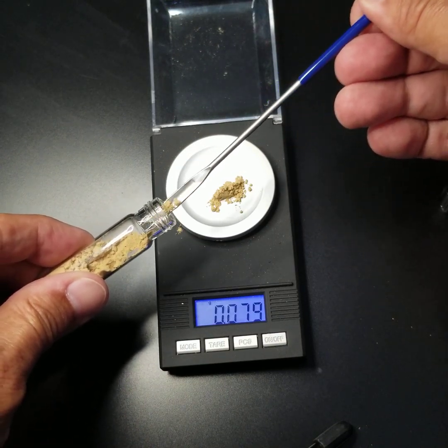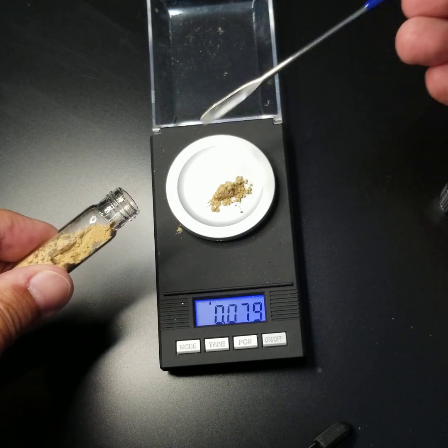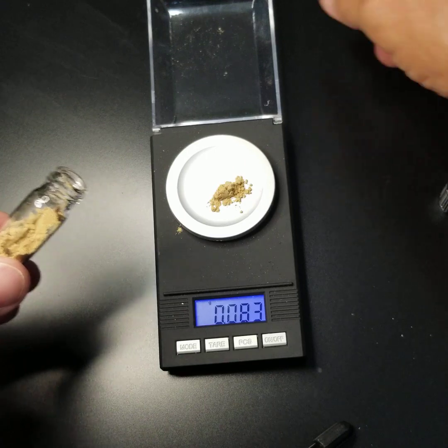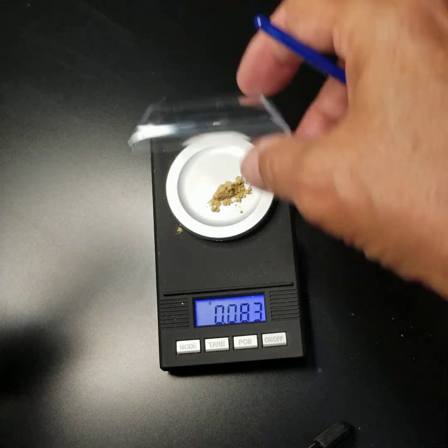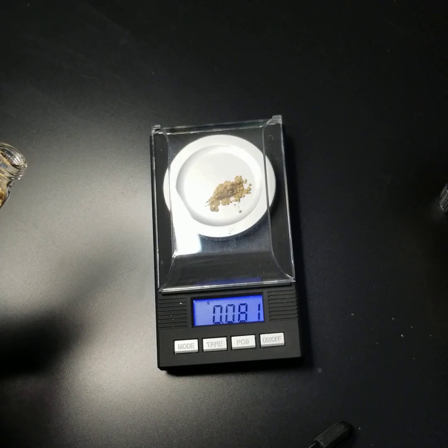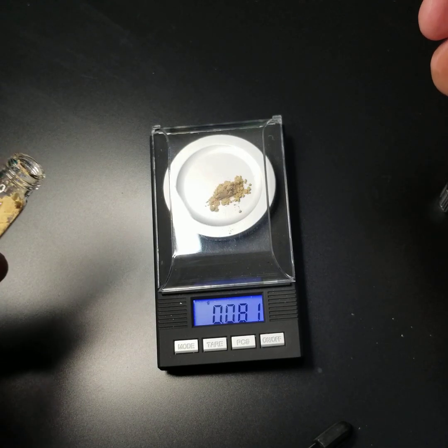There we go. That's why the spatula is just so small. And there we go, 0.8083. We'll close the cover to get an accurate reading on that. And we've got a solid 0.81.